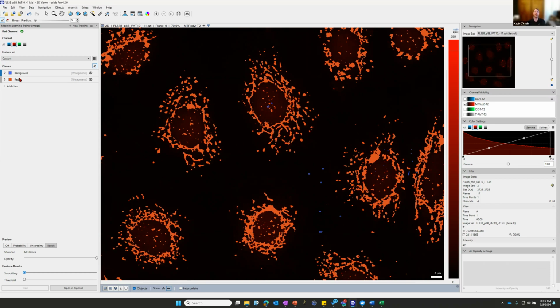There will be a point in machine learning, because it's just a pixel classifier, right? It uses a random forest algorithm. It doesn't have any concept of object shapes. So there will come a point in machine learning where you've done as much annotating as you can. It's just going to reach a limit at some point. And if you still can't get it and it's just not going to train anymore, then you'll probably have to go to a deep learning route. But you would want to hit that level first. And usually it's totally data dependent. You'll just have to kind of test it yourself.